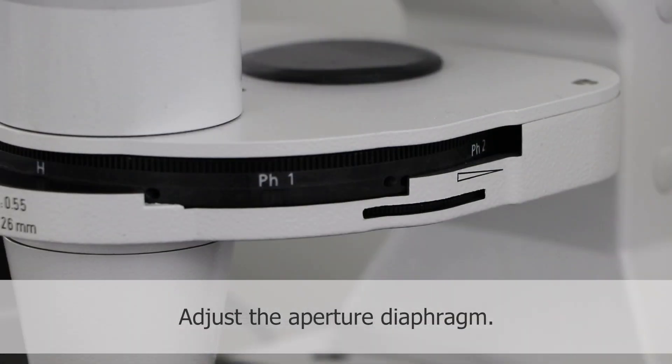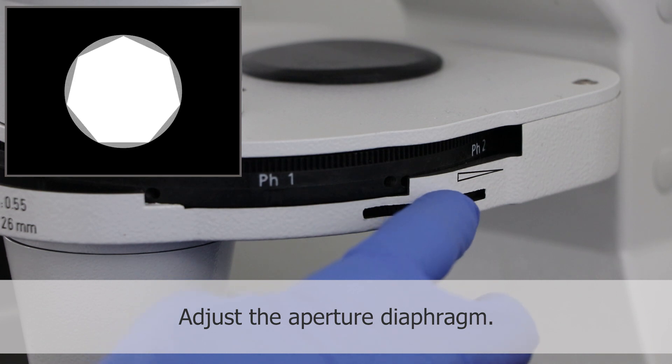Adjust the aperture diaphragm until the visible objective opening is illuminated at least by two-thirds of its diameter.